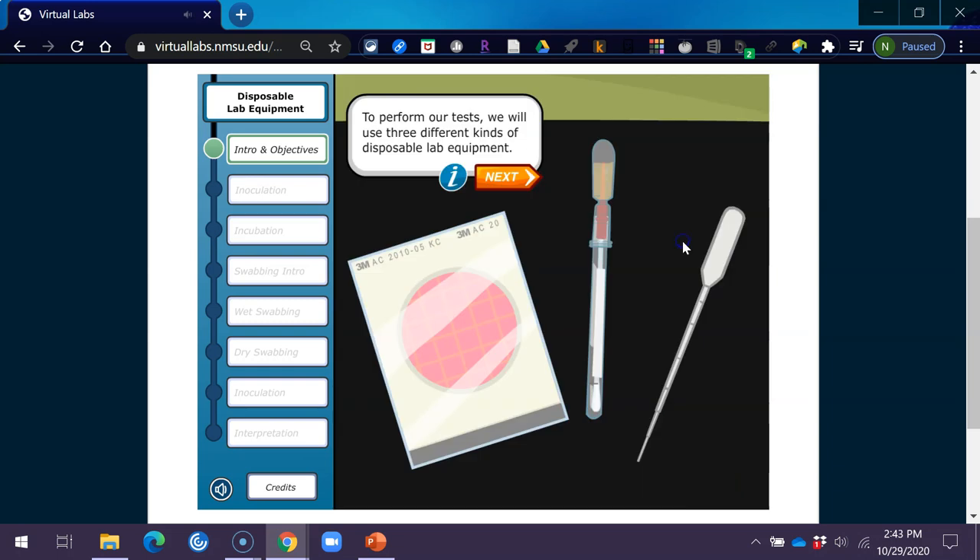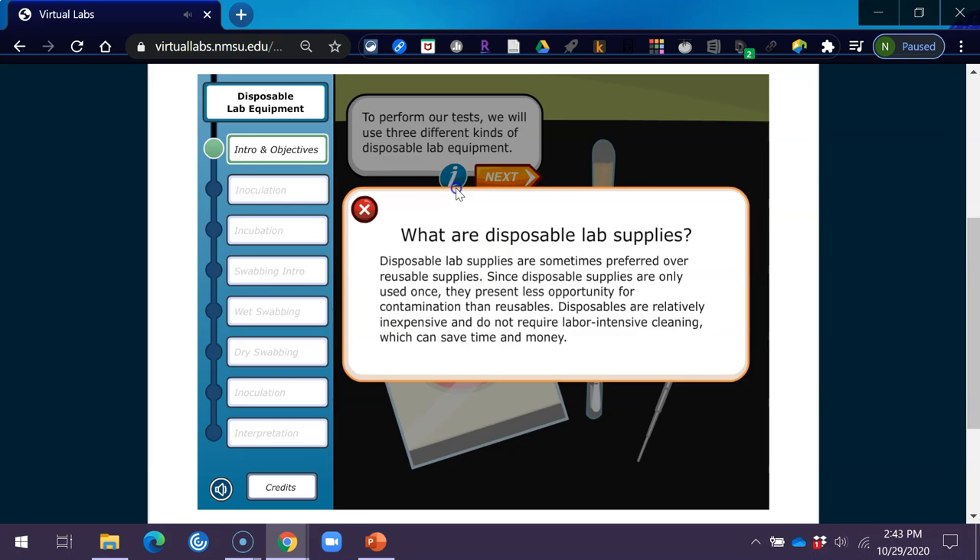To perform our tests, we'll use three different kinds of disposable lab equipment. Disposable lab supplies are sometimes preferred over reusable supplies. Since disposable supplies are only used once, they present less opportunity for contamination than reusables. Disposables are relatively inexpensive and do not require labor-intensive cleaning, which can save time and money.